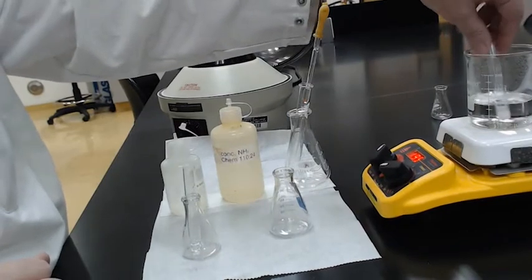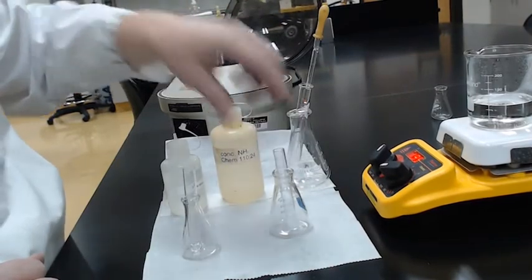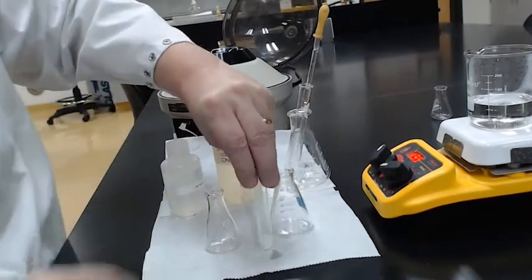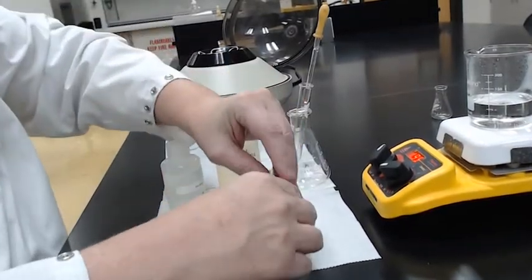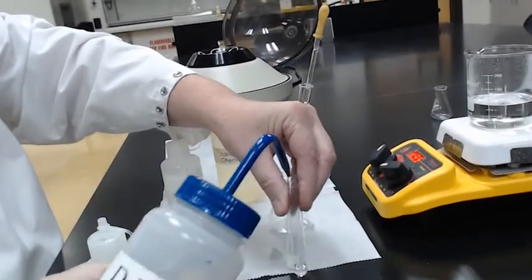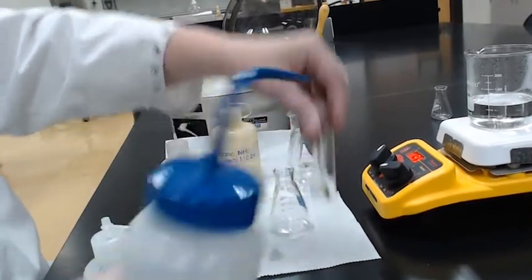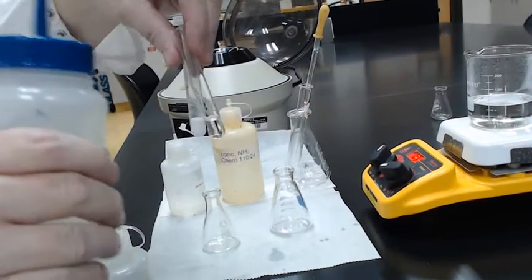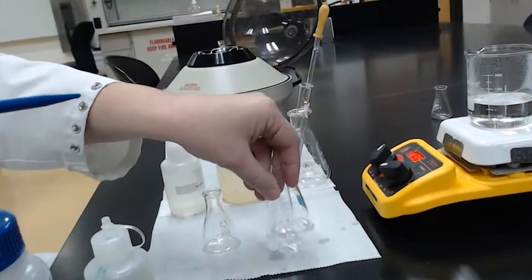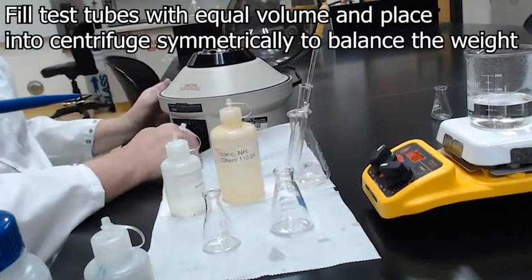Okay, so it's been a minute now, and it gives us a chance for our carbonates to precipitate. And our next job is to separate the precipitate from the liquids. And again, what I have to do is make the 2 heights of the liquid the same. So I can't see when I'm looking when it's sideways, so I'm going to gently add water until the 2 look the same height. That's good. A little too much, we'll add a little water this side, doesn't hurt. Okay, fairly close. So we made the 2 levels approximately the same. We now need to put it into the centrifuge, and we turn the centrifuge on, and you're supposed to close the door.